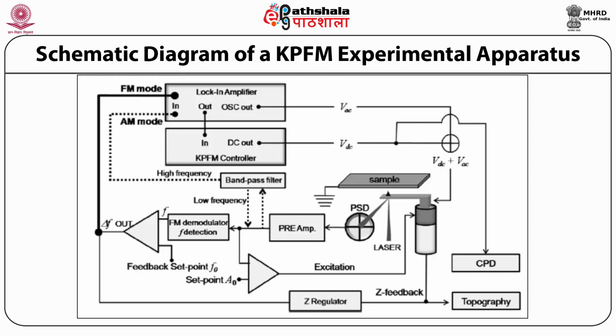KPFM measures a contact potential difference (CPD) between the sample surface and the tip. In high resolution KPFM, CPD is strongly affected by the short range force between tip and sample. The CPD associated with the short range force is specifically referred to as the local contact potential difference (LCPD).